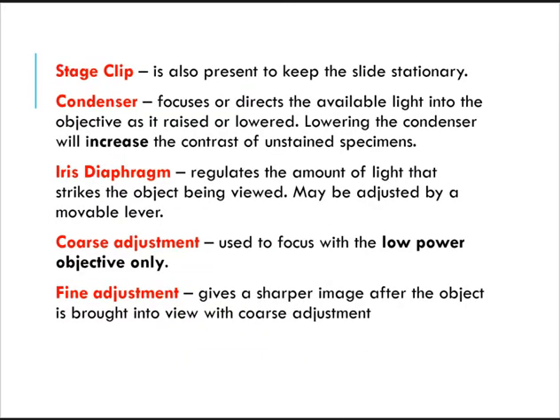Now, next, we have your stage clip. It keeps your slide stationary so it doesn't move elsewhere, just like your crush. Anyway, it is to keep it safe from falling or damage, because some med techs forget that they are using it.